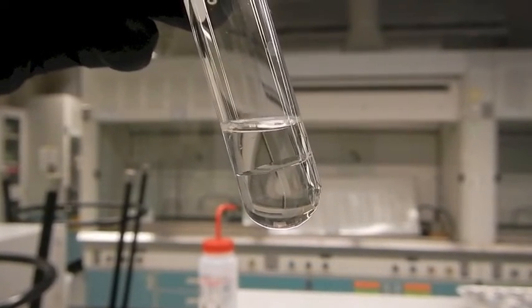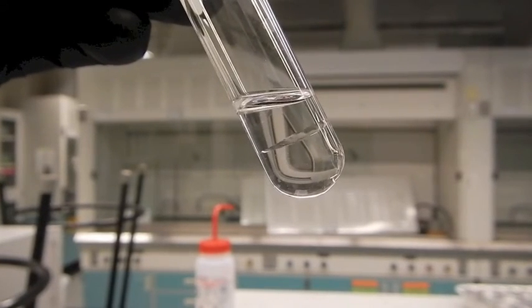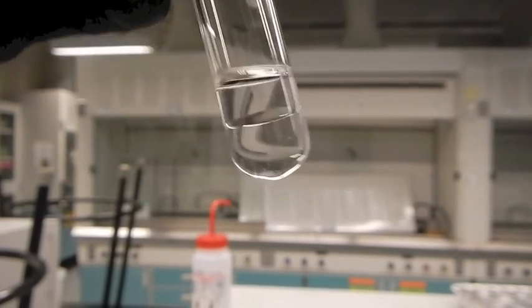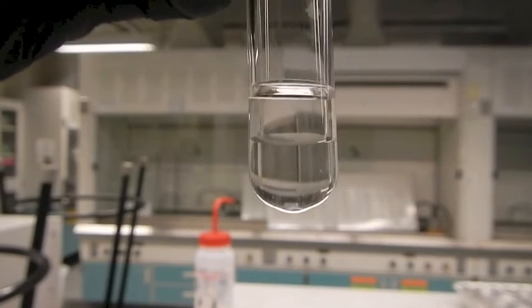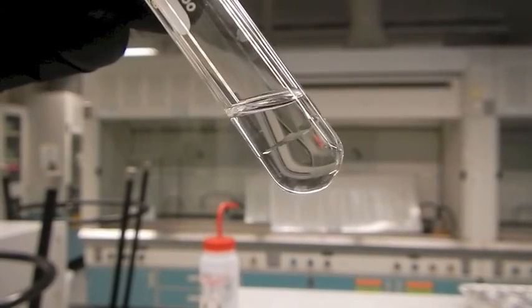So hopefully we can see this. We've got clearly 2 layers, a top layer and a bottom layer. And this is what we would call immiscible. The 2 liquids are not mixing together. If they're miscible, basically they'd mix together. We would not see any layering of the 2 compounds. So hopefully you can see that.